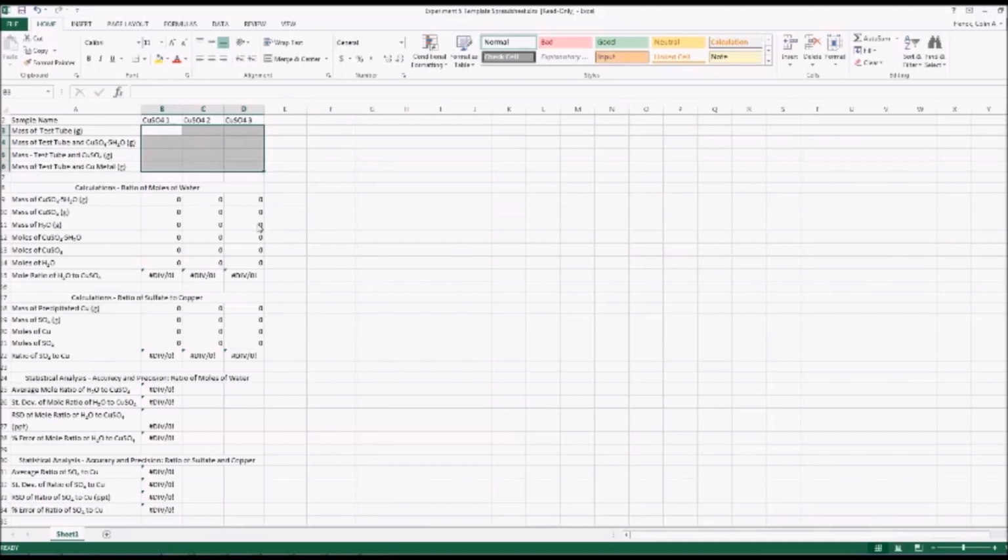I would strongly recommend that you watch this section of the video again after downloading a copy of this template from Blackboard. Then enter all of your calculations into Excel as you go. You can use the numbers that I had up here to make sure that all the numbers match as you go. Therefore, you will have your entire Excel sheet ready to go before you come in. Enter the experimental data, and you will know everything without having to do the calculations during the precious lab time.